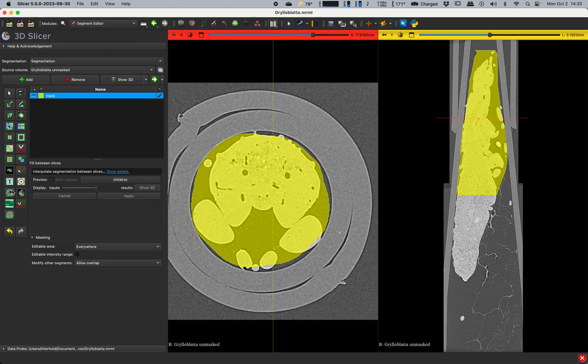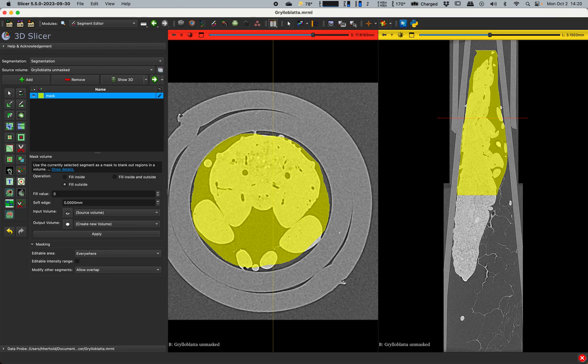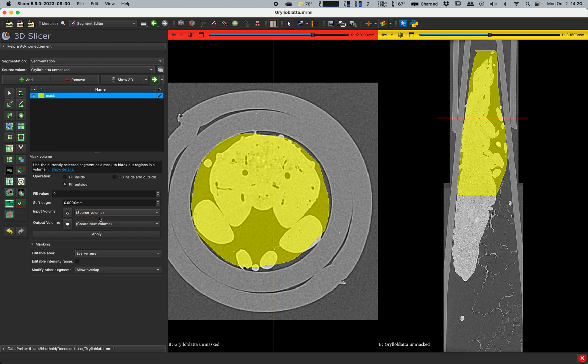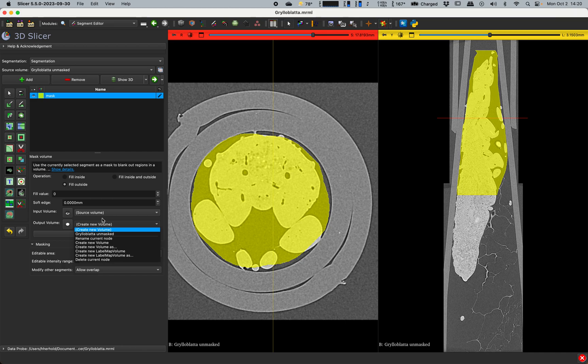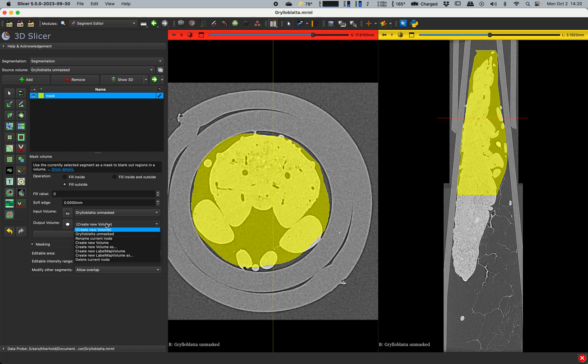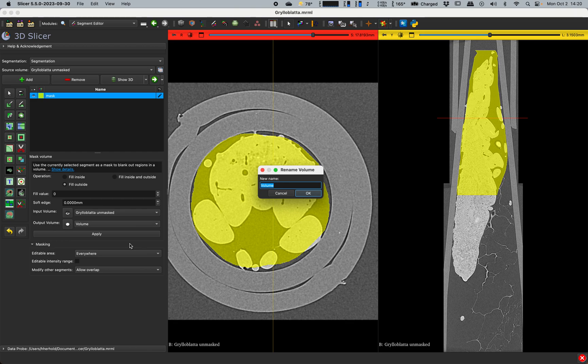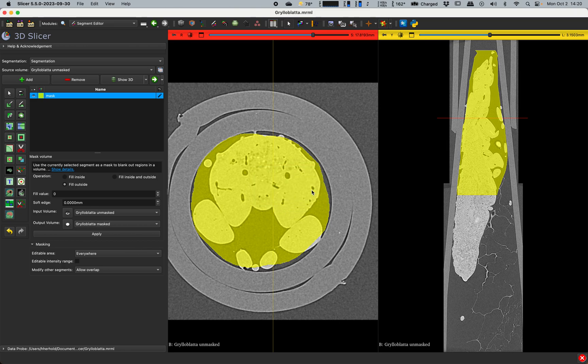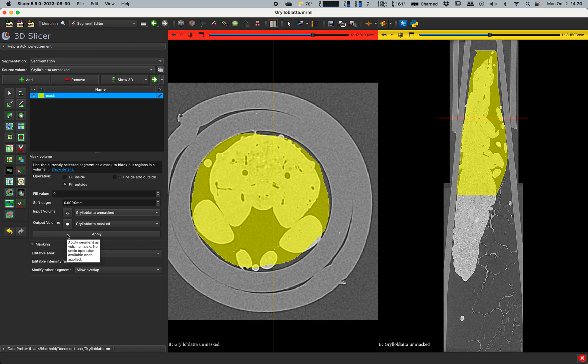And then this makes a segment that I will then use as a mask. And it will mask off everything outside of this. So over here, we've got mask volume. Our input volume is the source volume. Our output volume, well actually we'll just say Grylloblattid unmasked. Our output volume, we'll create a new volume as Grylloblattid masked. And we want to fill the outside with zero. And then we'll hit apply.